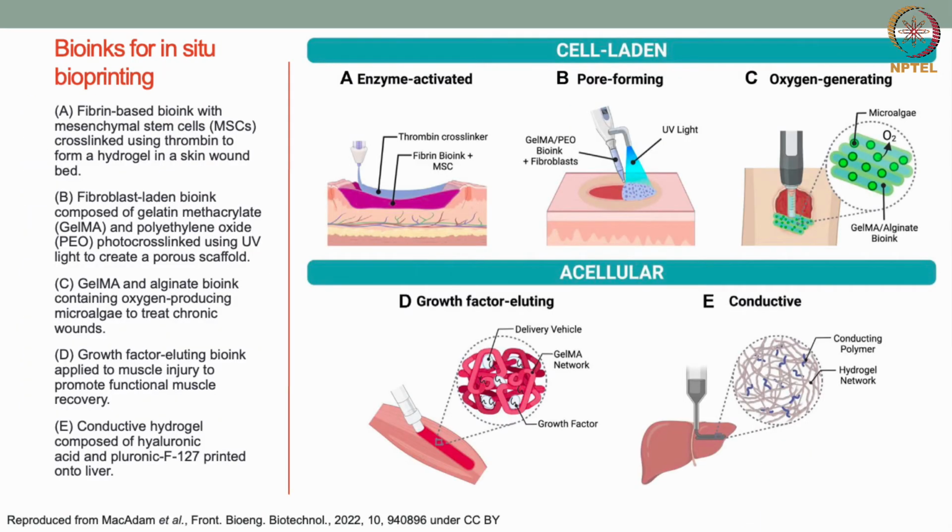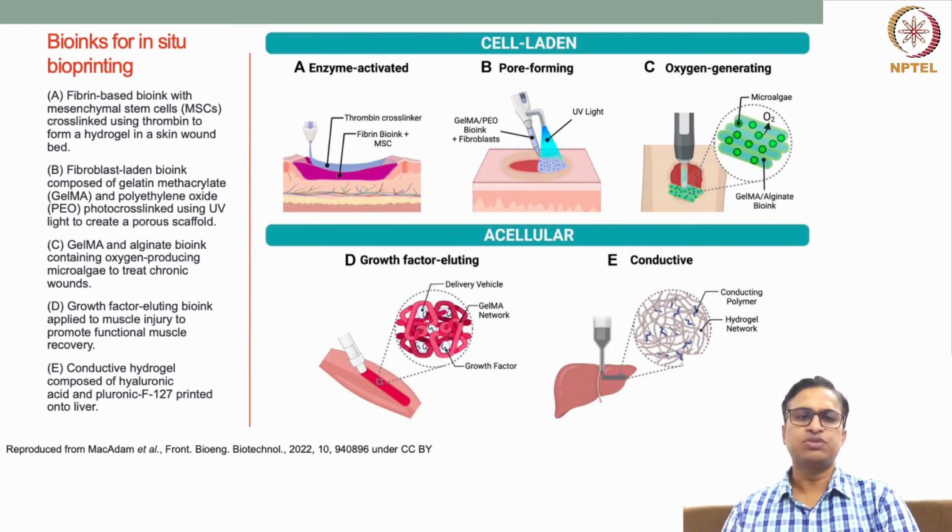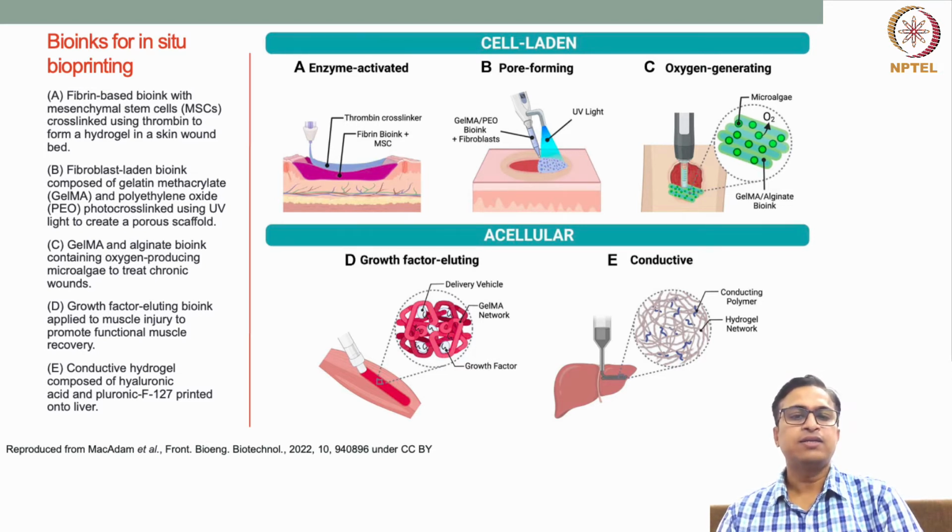Let us now discuss the different bioinks that have been used for in situ bioprinting. So please remember, these bioinks are already being used for conventional bioprinting, where these bioinks have been used for different applications, and also different types of gelation mechanisms or strategies have been used.